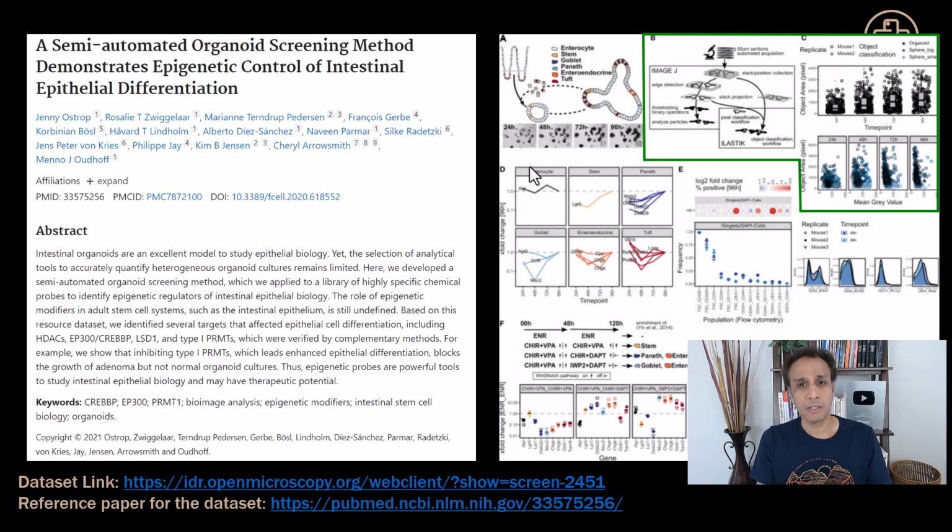So you have multiple wells. In my case, I have 6 wells. And for each one, there are 5 time points, meaning time 1, time 2, time 3, 4, and 5. You have different images. And how the organoids actually grow, how organoids change their shape, is basically what we are after. And how do you quantify that? For example, here is a plot that shows, for each time point, how the object area changes. And I'll also include analysis that helps you statistically determine whether the changes between each time point are statistically relevant or not.